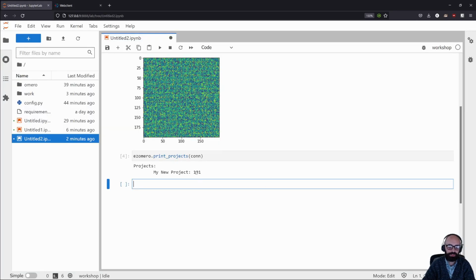And in general, that's going to be your starting place. So your input to an algorithm or whatever will be a hierarchy level that's normally going to be your project or your dataset or whatever. So I'm going to just make project ID to be 101 here, but this is normally the kind of thing that will be a user input to some degree.